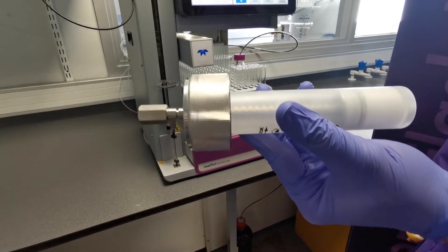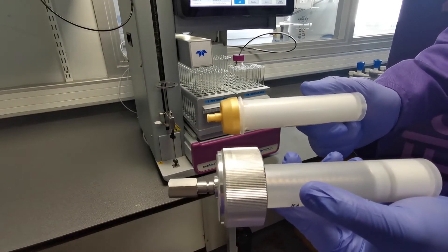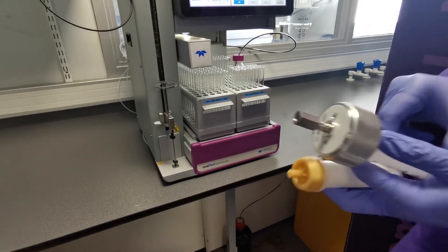So now that we've prepared our dry loading cartridge, all we need to do is load this with our column onto the machine and we're ready to run our purification. So let's give that a go.